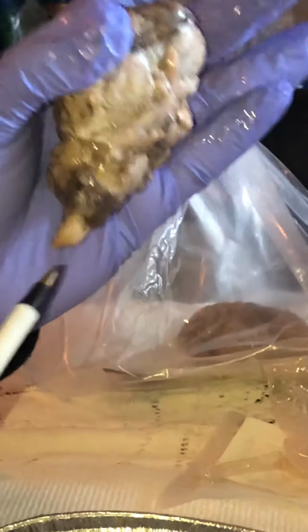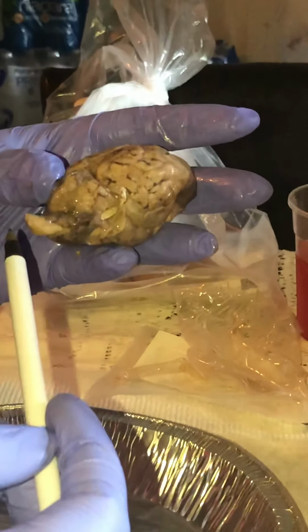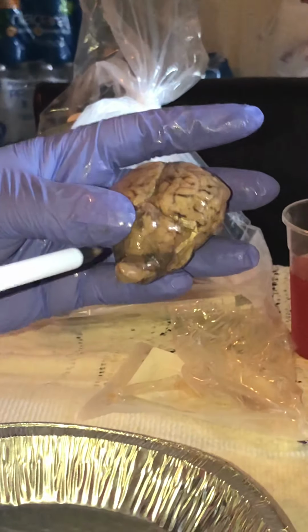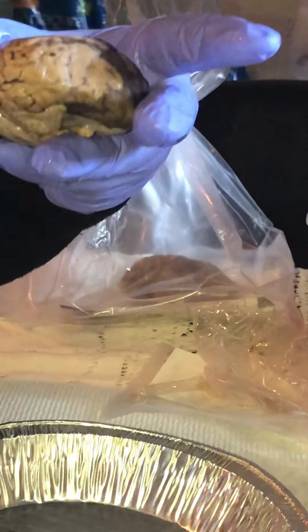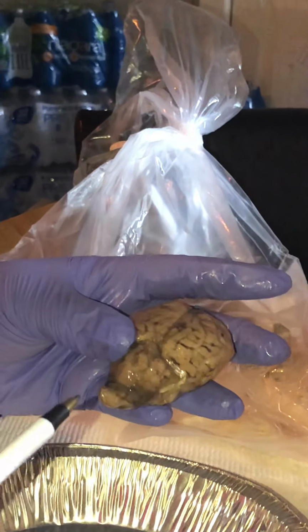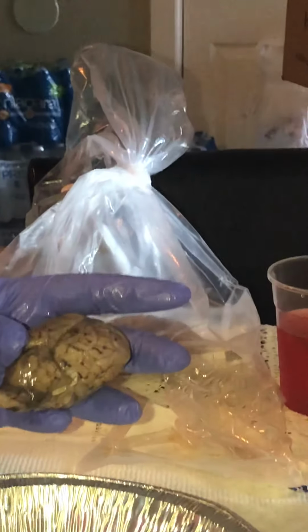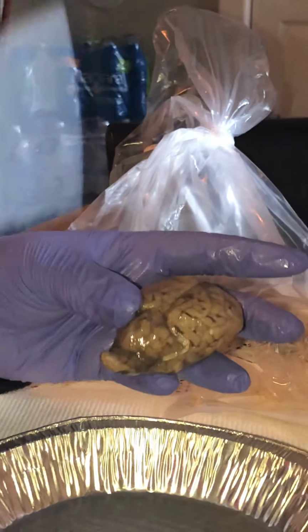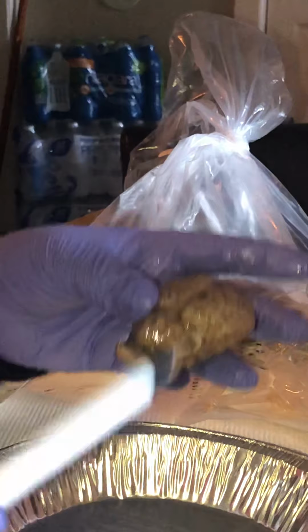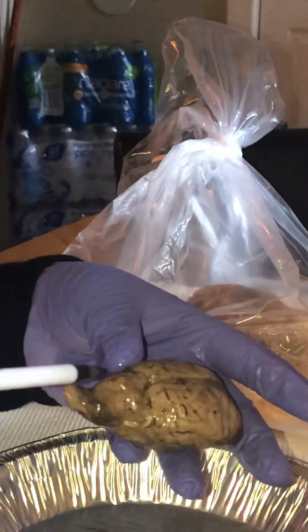And then we have the spinal cord, of course. The spinal cord is positioned like this on the sheep versus the human, because the sheep's head is made this way. Instead, in humans the spinal cord would have been here. The spinal cord is what carries your afferent and efferent signals up and down, which controls your movements and contractions and things like that. So that's your spinal cord.